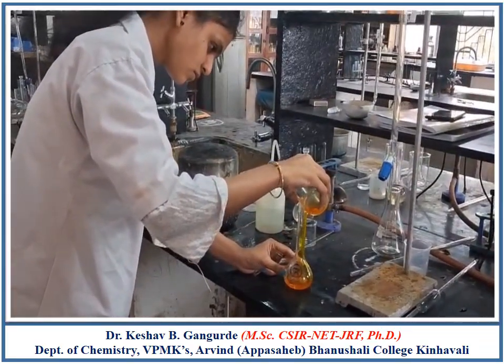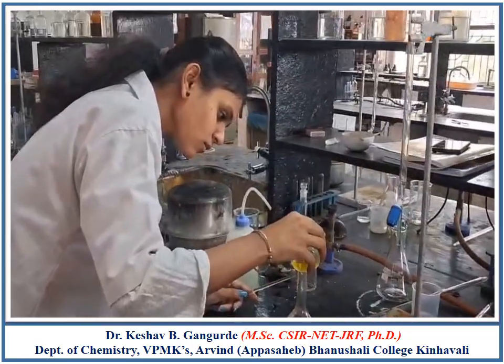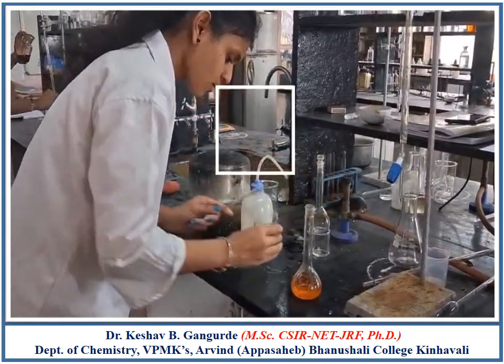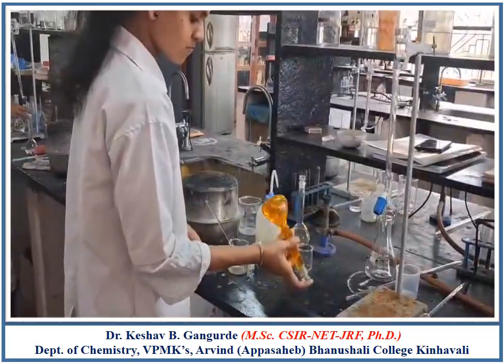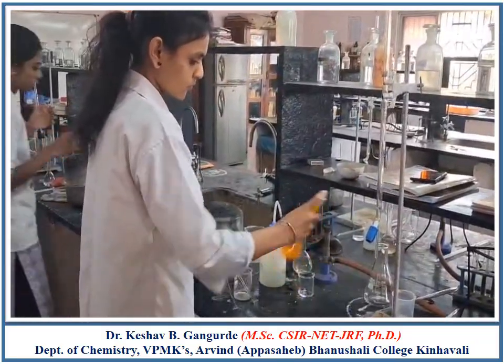Dilute the solution in 100 ml standard measuring flask by using distilled water to get 0.1 normal potassium dichromate solution. Stopper the flask and shake vigorously to get homogeneous solution.